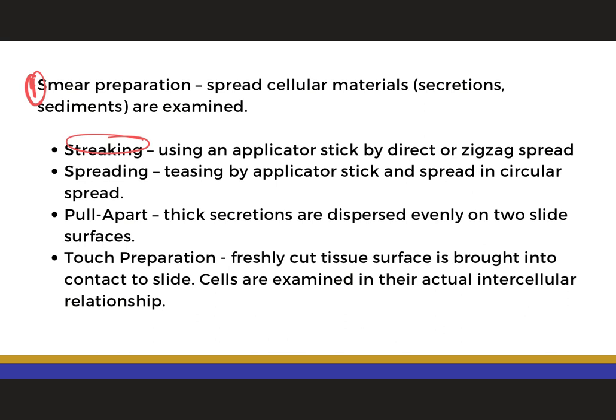So in here, a selected portion of the material is being transferred to a clean slide, and afterwards you are going to gently spread it into a moderately thick film by teasing the mucous strands apart with an applicator stick. So it is especially recommended for smear preparations of fresh sputum and bronchial aspirates.